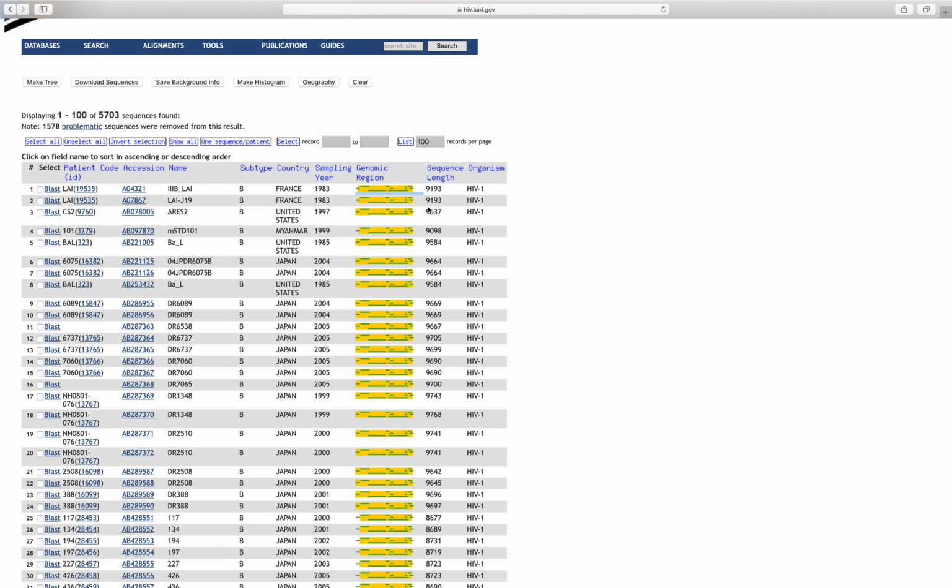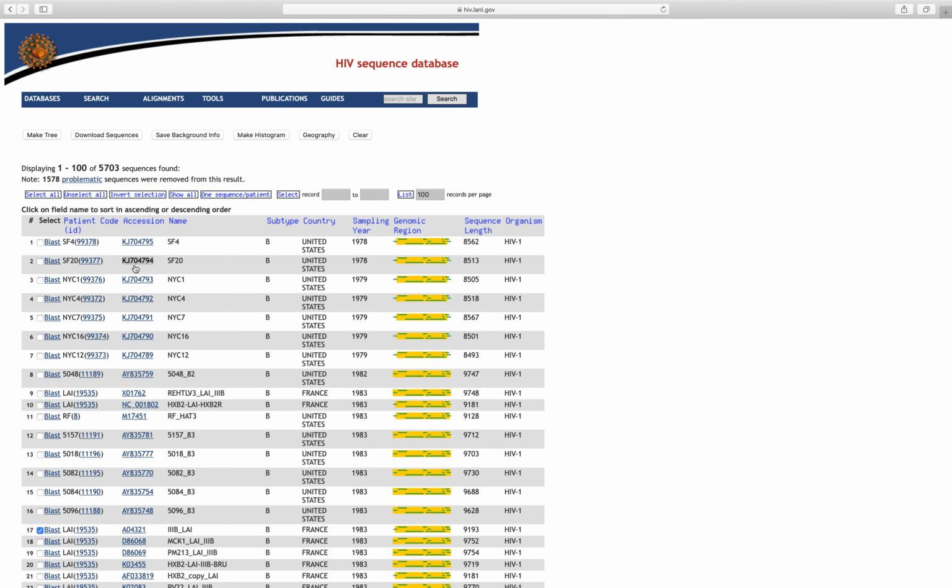So what I was trying to do, I'm sorry, is click this. They do have some earlier sampling years. We can look for this one that was selected here, which was the first one just by default. Let's say we want to look at a few, so we want to use that one. That one is the reference for HIV-1.